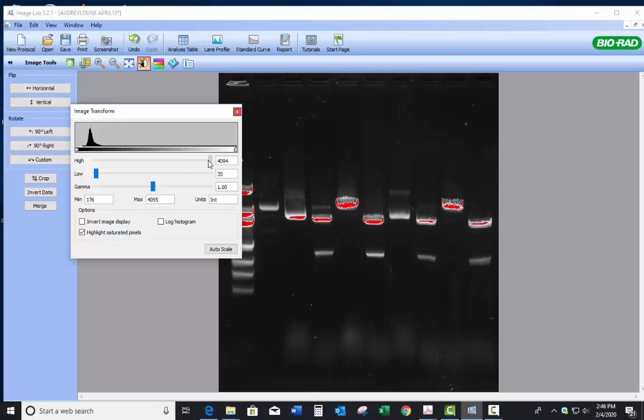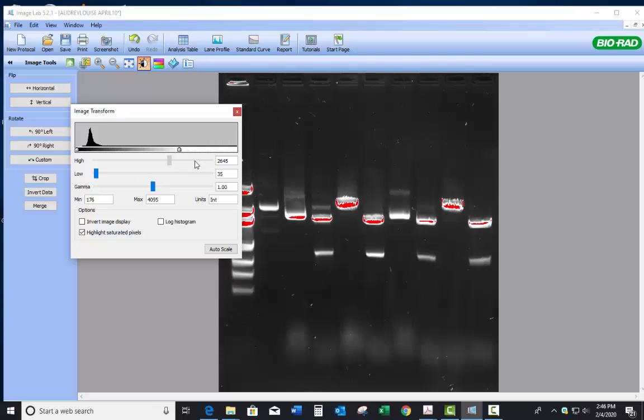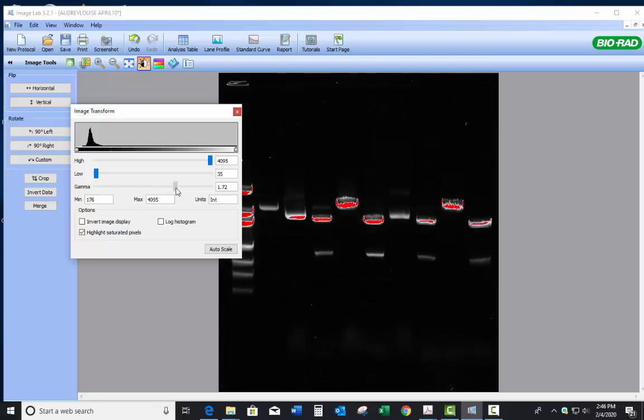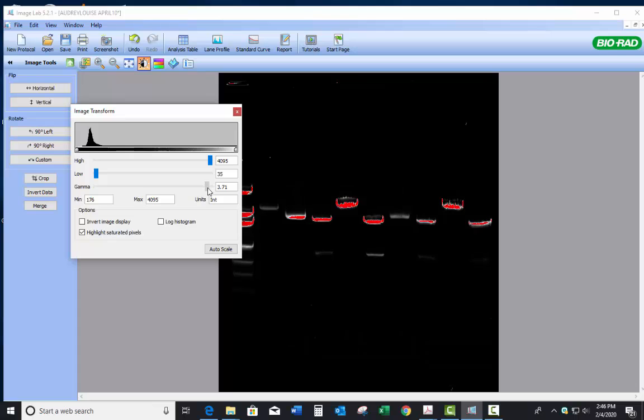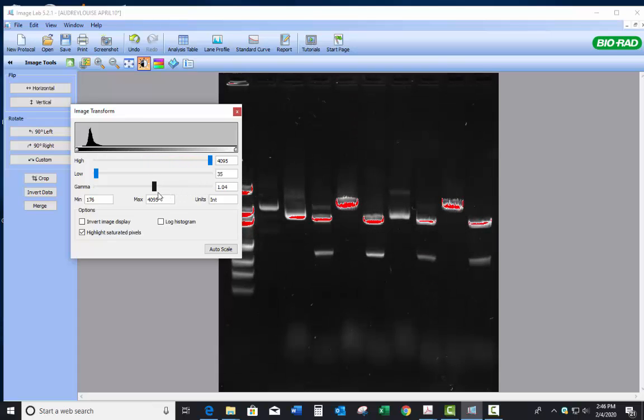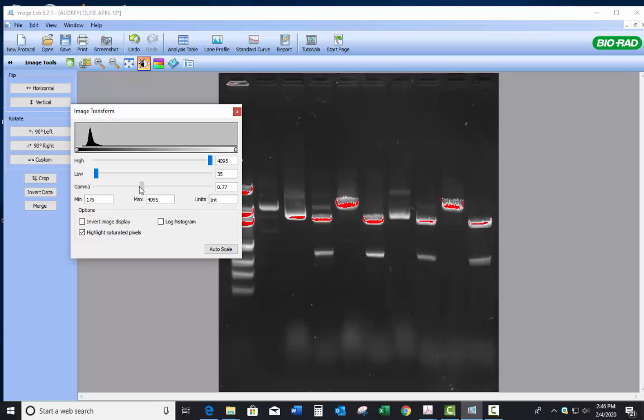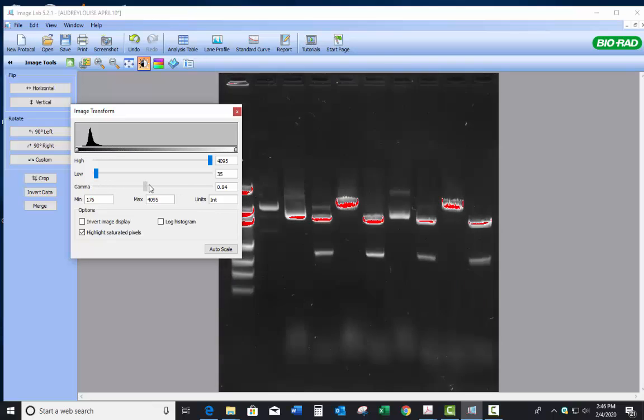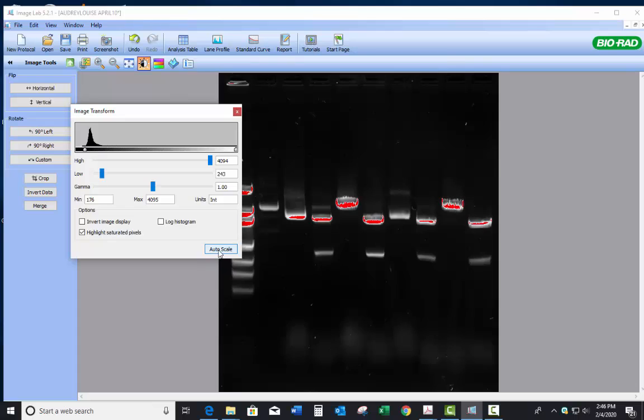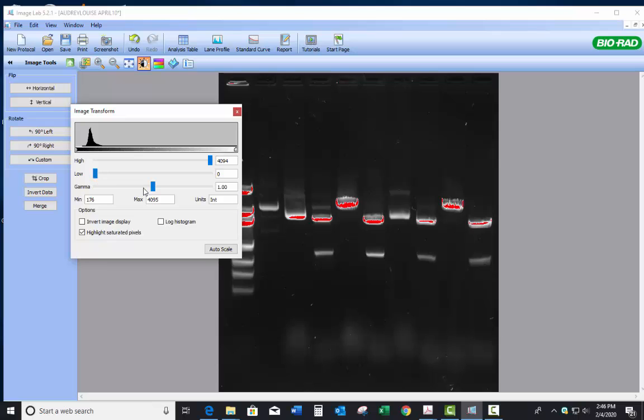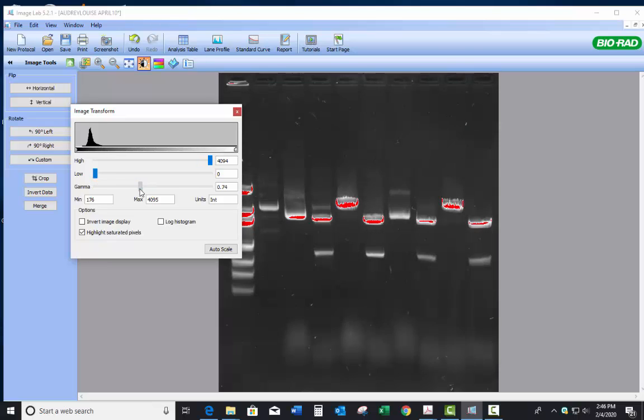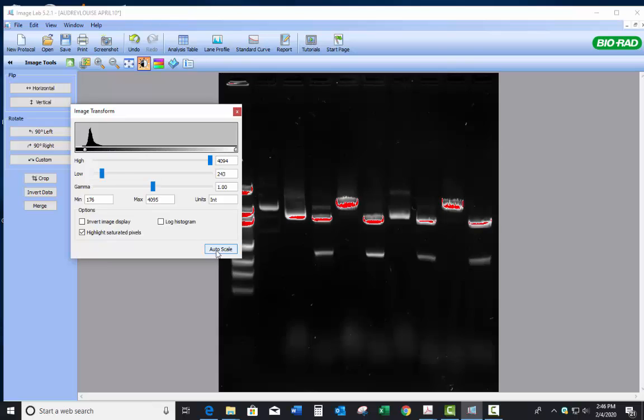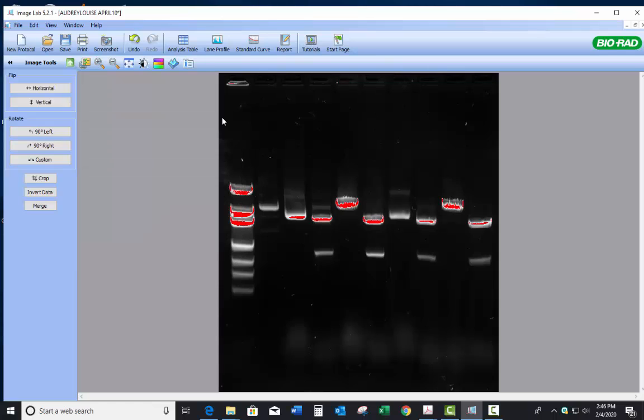You're just using the slider layers. What you don't want to do is you don't want to do something like that, because what you've just done is you've hidden these bands right here. So let's not hide bands. Find some, you know, auto scale often works pretty well. You can play with it a little bit more to make sure you see it. This works fine for me, so I'm going to X out of that.